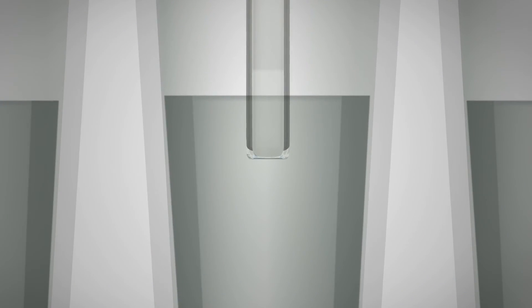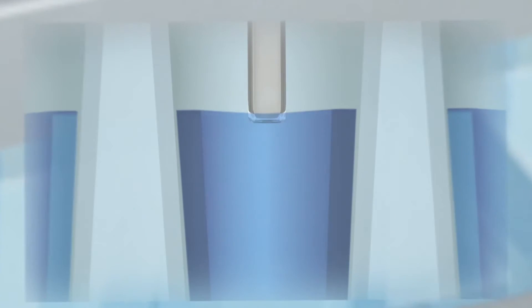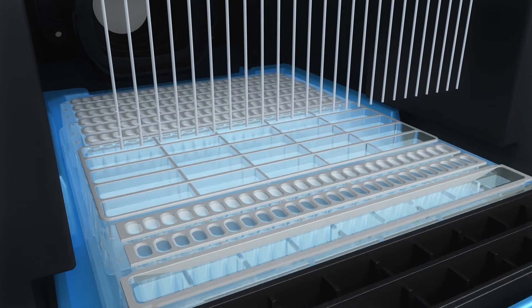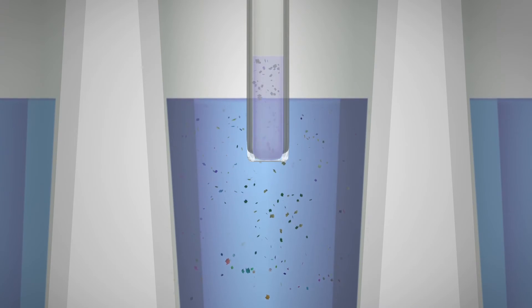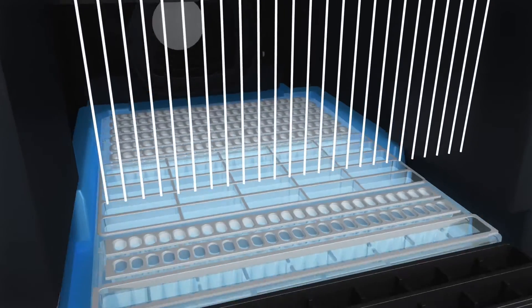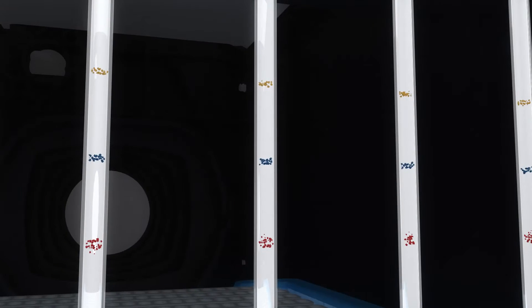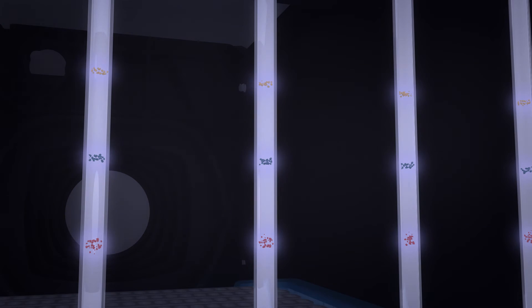Jess begins by aspirating the separation matrix and then the stacking matrix into each capillary. Next, your protein lysate is loaded and capillaries are lowered to make contact with running buffer. Voltage is applied to enable separation by molecular weight.